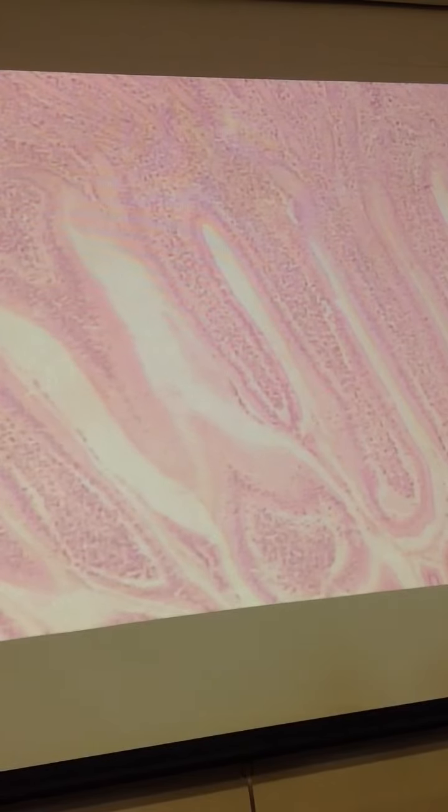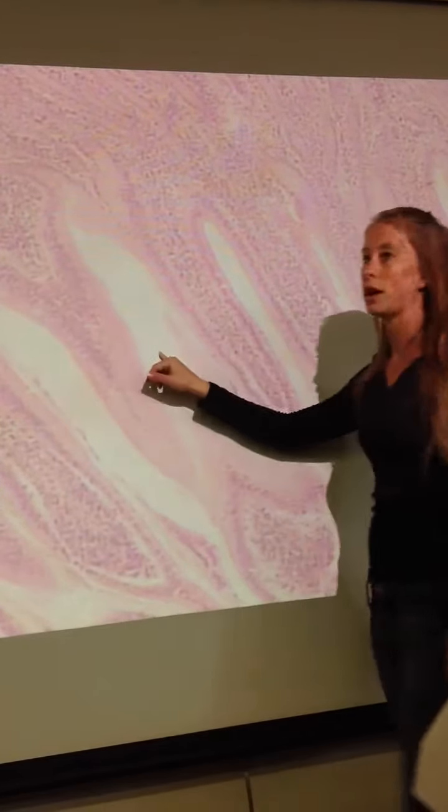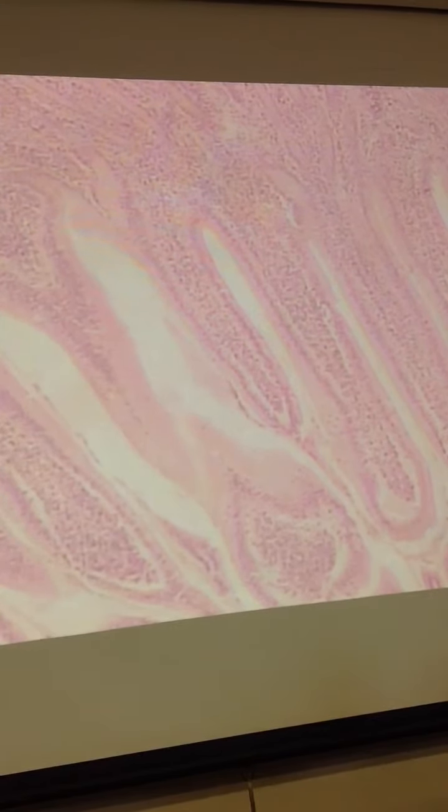Alright, the last thing we need to know are the duodenal or Brunner's glands. And, yes? What's that corner again? That crevice? The inside, yeah, so like the area in between the villi will be the crypts or glands. So it's the intestinal crypts or glands. There's also a name in parentheses, which I'm not even going to try to pronounce, but you can use that name as well. Okay, they're interchangeable.